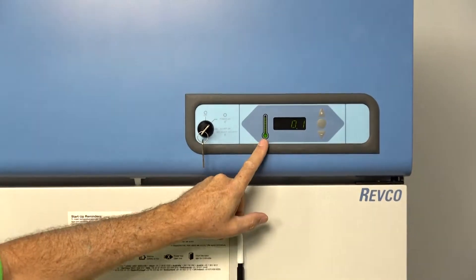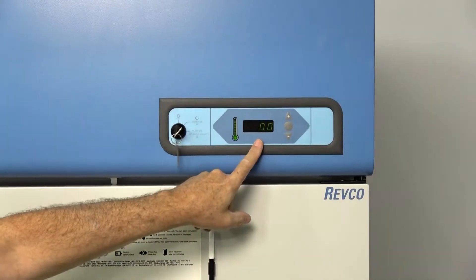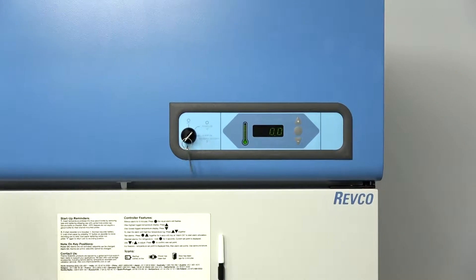Another nice feature is that the alarm will show you from across the room — if you can't read this — by just being able to see the bars, roughly what temperature it is.